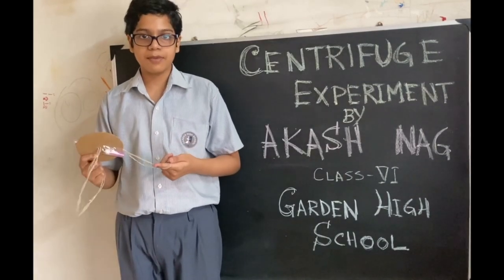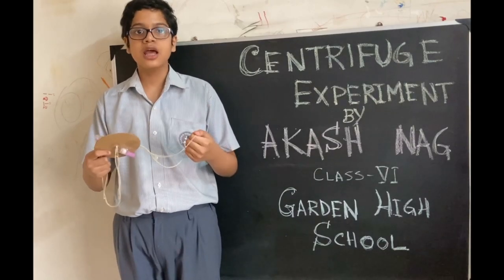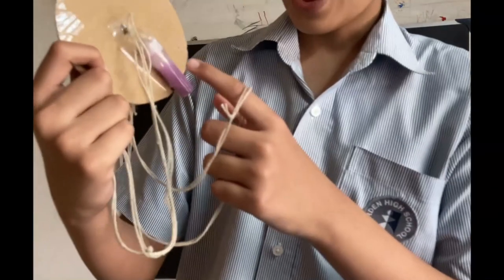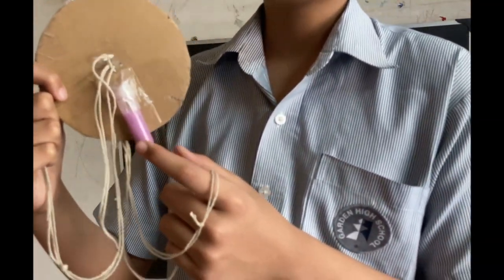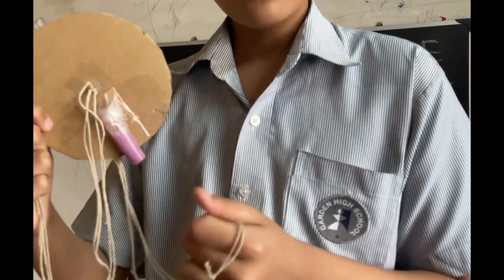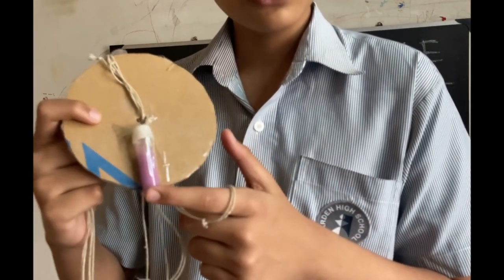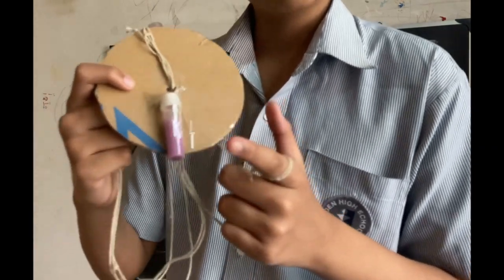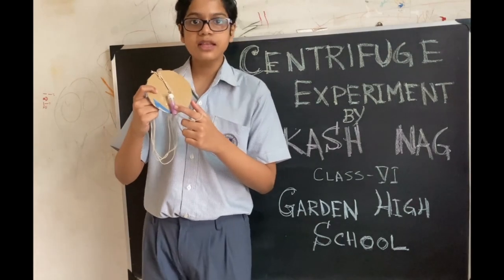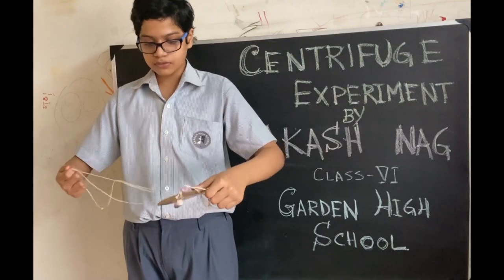As a part of our experiment, I will now show the process of sedimentation by using a centrifuge. I have made a solution of colored chalk powder and water in a glass tube. On the opposite side, I have also kept a similar tube which will work as a counterweight — otherwise the disc will not rotate properly. Now I will show you how this works.